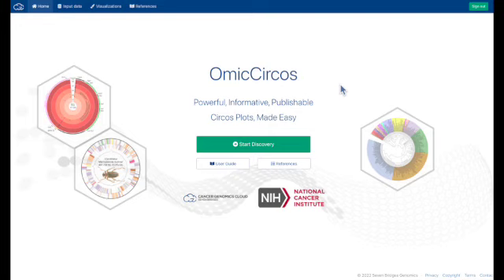So this is the Circos main splash page. We have a user guide available, as well as references that use this plotting tool. Once you're ready to start, click Start Discovery.